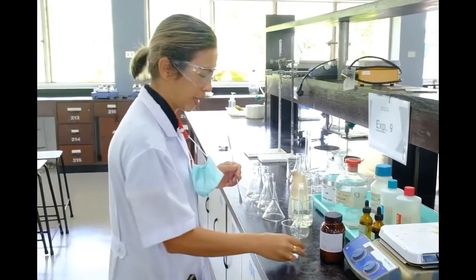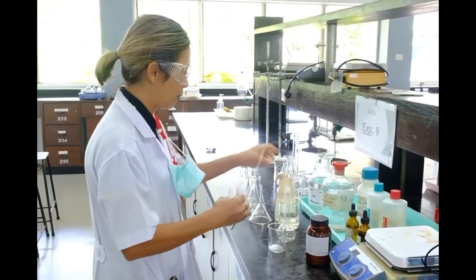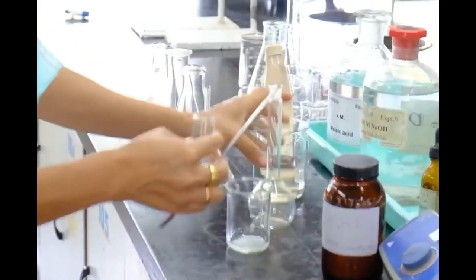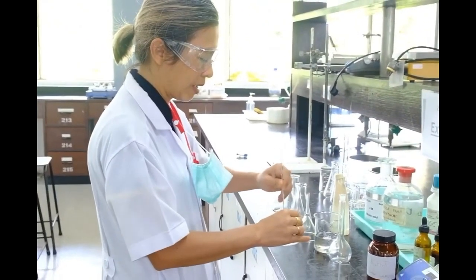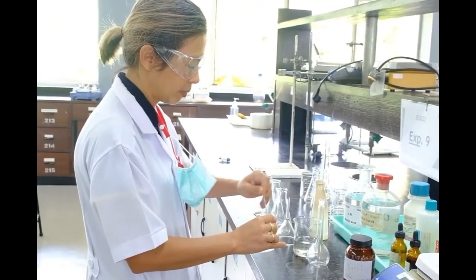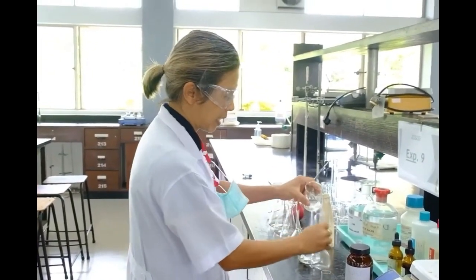After weighing, pour the solution into the beaker. Some solution may remain in the weighing flask. Rinse with distilled water. Then, add a small amount of water until the solution is completely dissolved, and pour it into the volumetric flask. After dissolving KHP, pour it into the volumetric flask.